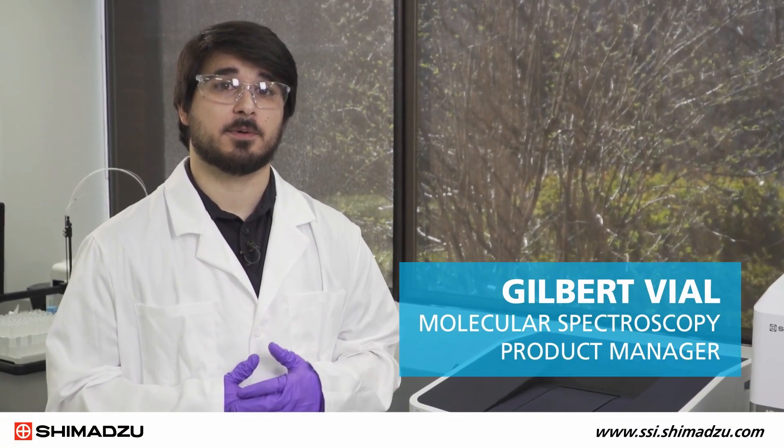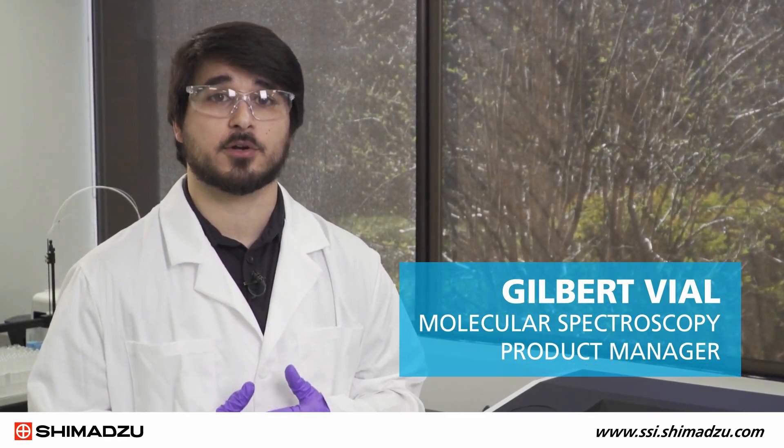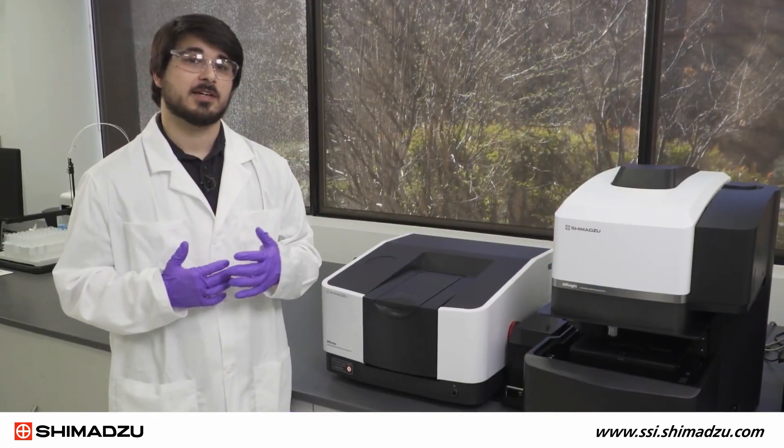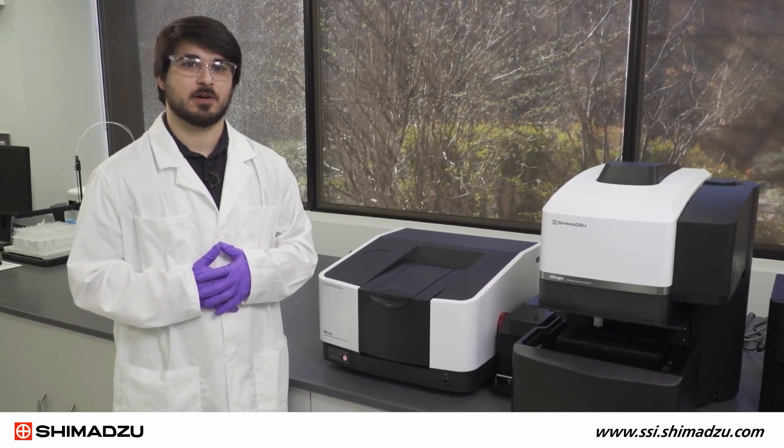Hello, I'm Gilbert Villal, the product manager at Shimatsu Scientific Instruments for Molecular Spectroscopy. In this video, we will introduce our new workhorse FTIR spectrometer, the IR CROSS. We will take a look at the exciting new features of this instrument along with the LabSolutions IR software.